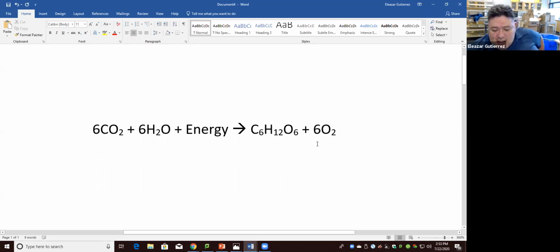so we're making a solution of bicarbonate. Okay, that bicarbonate, in the solution, is making carbon dioxide. So the bicarbonate is the source of the carbon dioxide that your plant discs are going to use in order to do this.